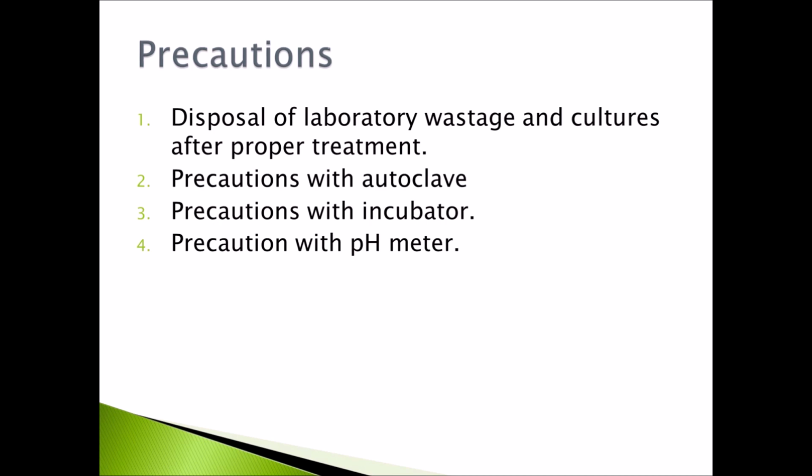Then, precautions with pH meter. A pH meter should be handled carefully so that its electrode may not be broken. The electrode should always be kept inside distilled water so that the electrode may not become non-functional.